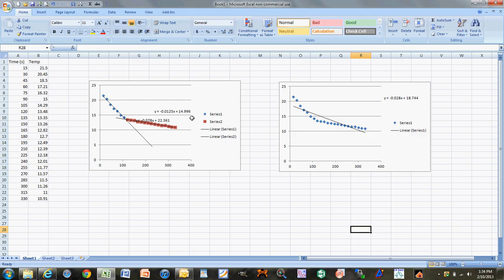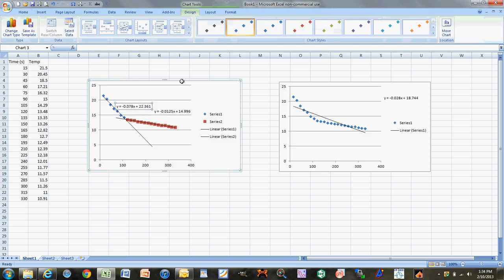Make sure your equations are printed on the chart, and label your axes — both x and y — with units. Give each graph a proper, descriptive title. Don't just put 'Part A, Run 1' — that's not sufficient. I want something like 'Time versus Temperature of Freezing Point of t-Butanol.' Make the title descriptive of the graph you made. Do this for all six graphs, print them out, and turn them in.